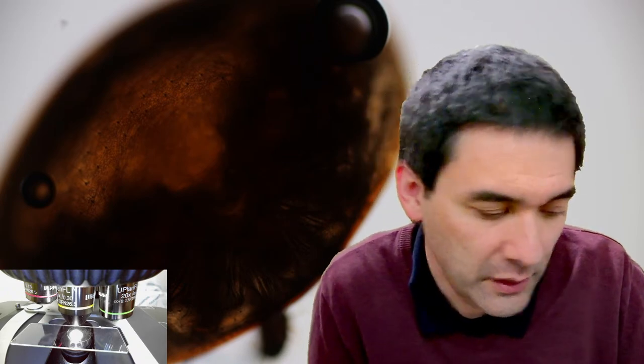For my personal purposes, this is not so important because I'm doing this as a hobby and for educational reasons, and therefore it is not so critical. So I just use a general mounting medium like the glue. But strictly speaking, there are certain recommended mounting media for certain specimens. For example, if you want to see the fine structures of diatom shells, you should use certain mounting media and so on.